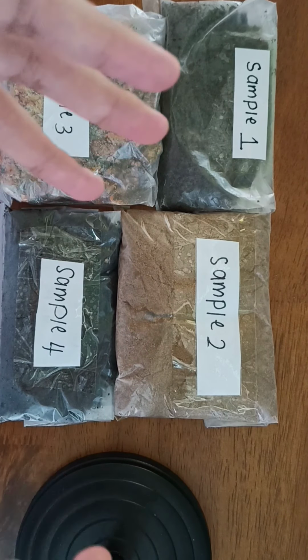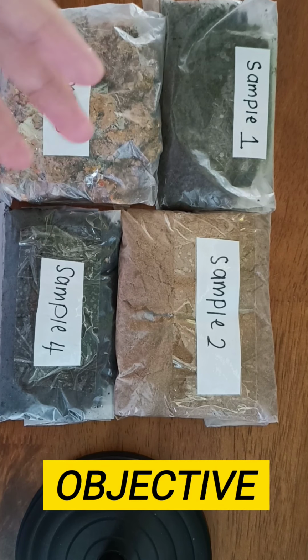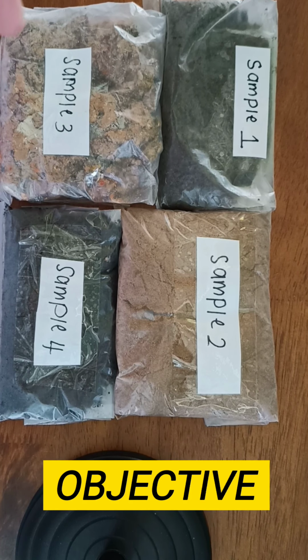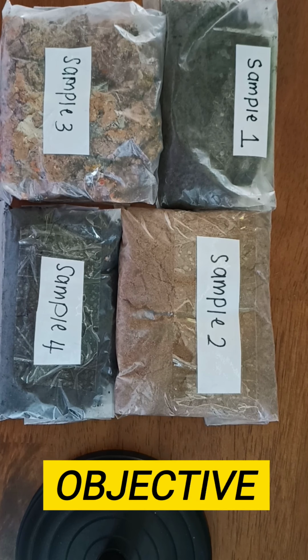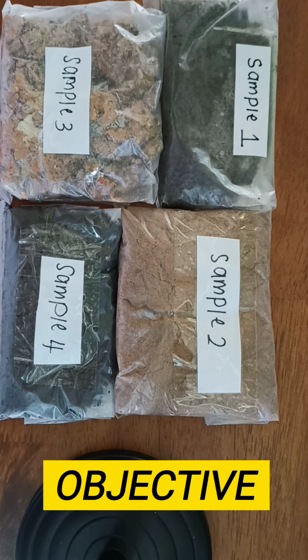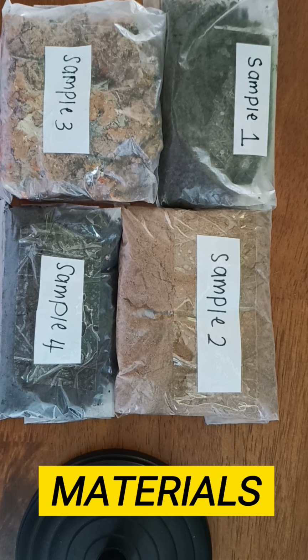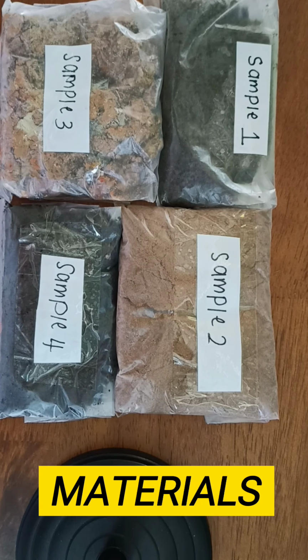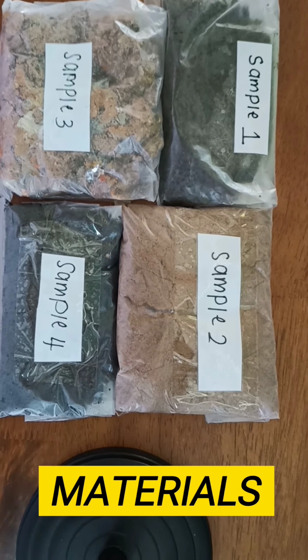For the next experiment is soil color. The objective of this experiment is to familiarize oneself with different colors of soil, to apply the Munsell color chart for soil color determination, and to determine soil color at field using the Munsell chart. To conduct the experiment, the materials that we need are 4 types of soil sample, which are sample 1, sample 2, sample 3 and sample 4, and soil sample air dried.